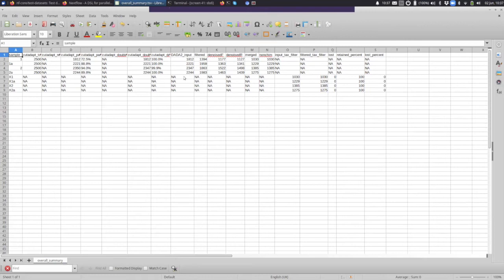And then we see the statistics from the Dada2 denoising. How many sequences we had when we came into Dada2, how many survived the cutting of the length of the sequences. I'm not going to go into that detail today, but it's very important how you cut your sequences in Dada2. How many pass the denoising steps?